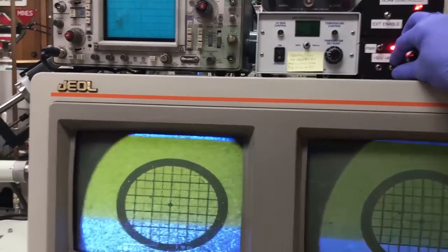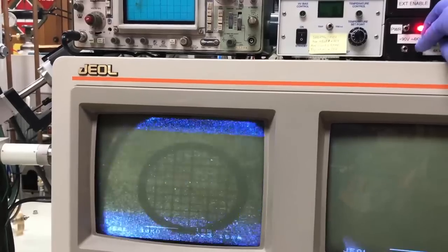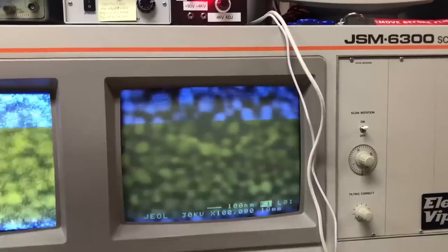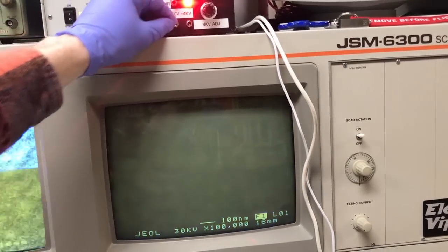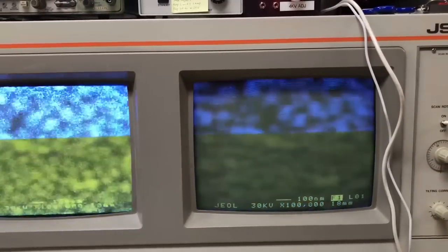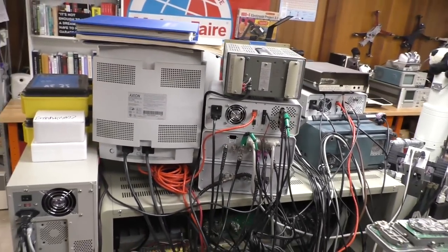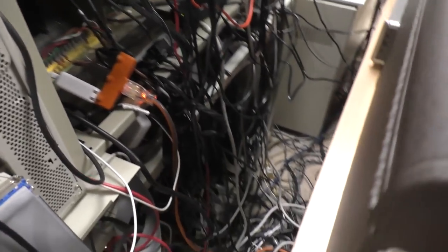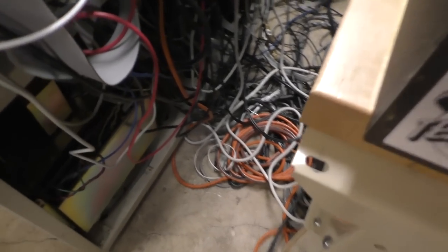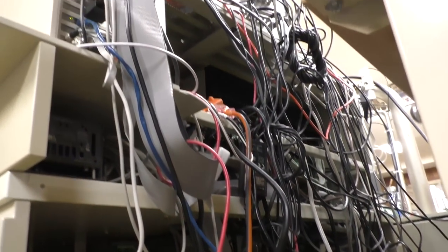It works pretty well as you can see here. I've obtained an image on the microscope, and I can adjust the high voltage on this beam blanker — the image will go in and out, and the measured current on the sample will go up and down. Here's a look at the back of my microscope. I keep adding little boxes and detectors and amplifiers for all these projects, and it's getting really out of hand — it's a total mess back here. Definitely a fire hazard. I counted for fun — there's about 45 outlets chained together on the same circuit.